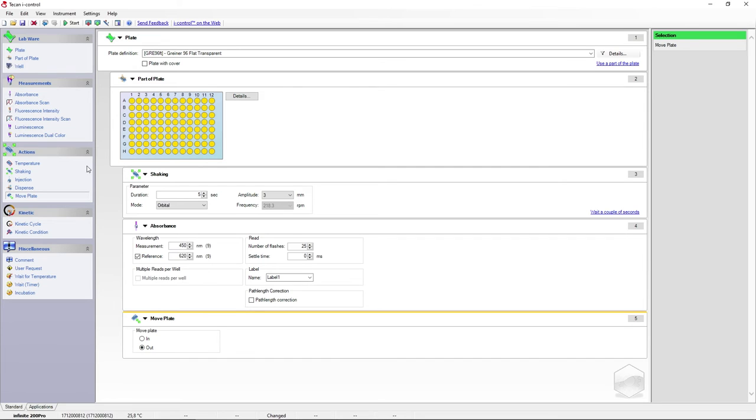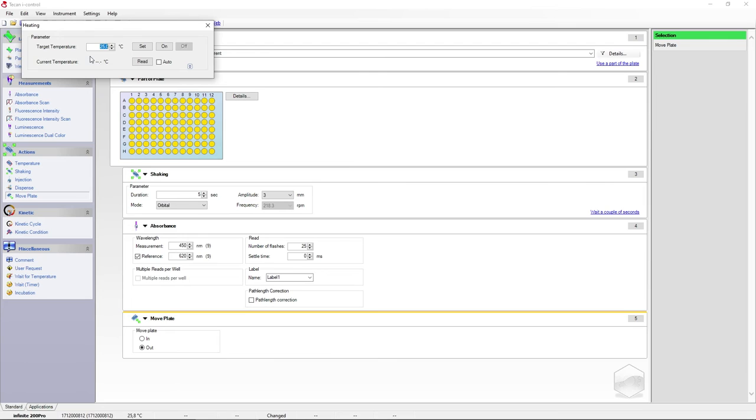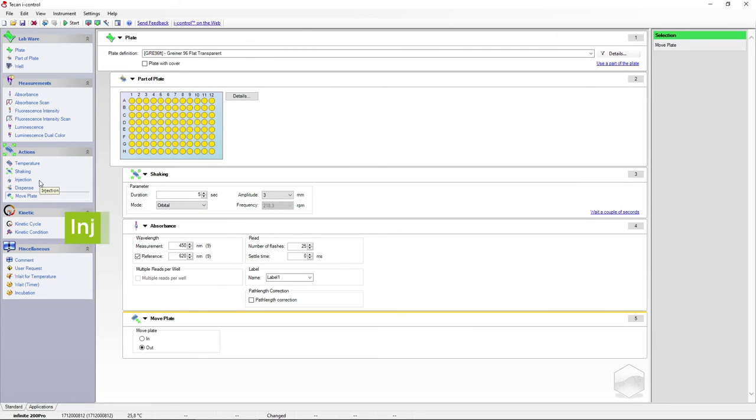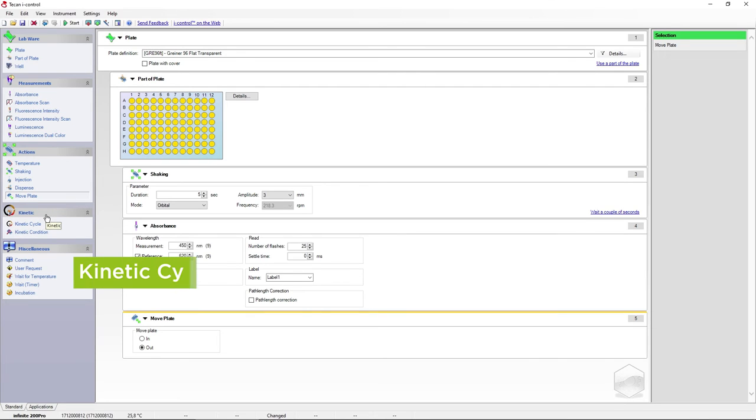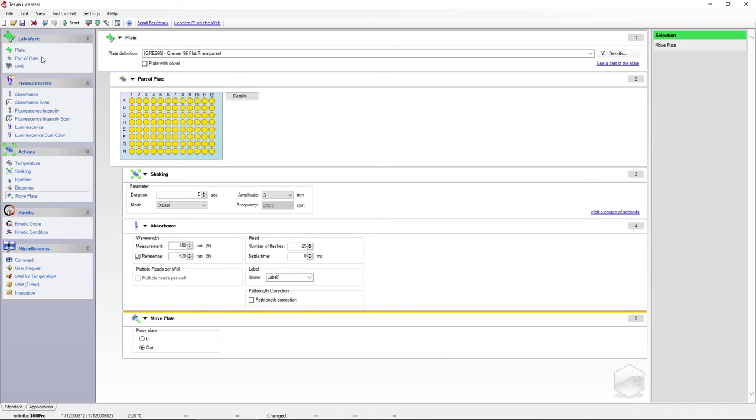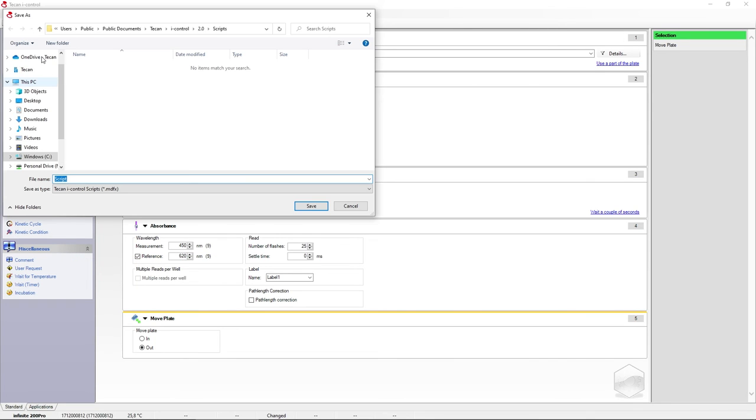The Infinity 200 Pro also has temperature control. You can preheat your instrument in the instrument settings if you need to. And if you're using an injector module, you can control it here. Sometimes you may want to set your assay to run over a certain length of time. You can do so by using the kinetic cycle parameter. And then you can save your settings as a template for future experiments.